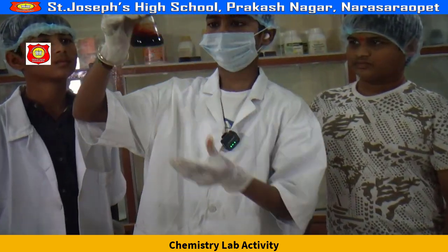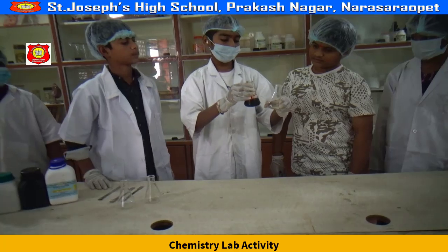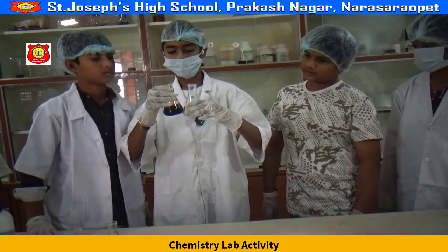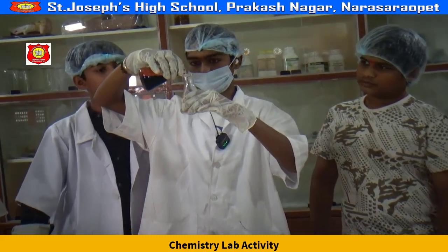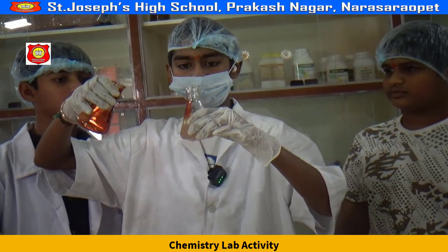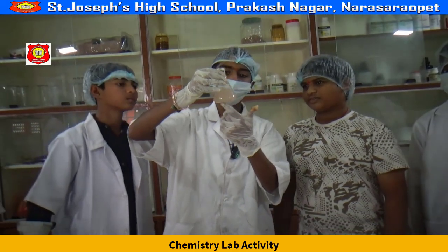As you can see, it is similar to the color of blood. Now I'm going to ask my companion, can we make this color return to its normal state? Yes, we can. When we pour this solution into the solution of sodium fluoride, now we can see that it's returned to its original state.